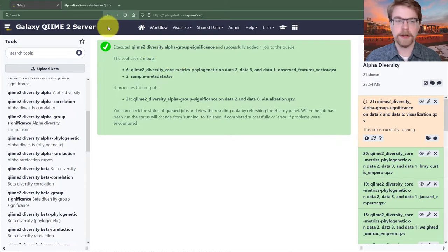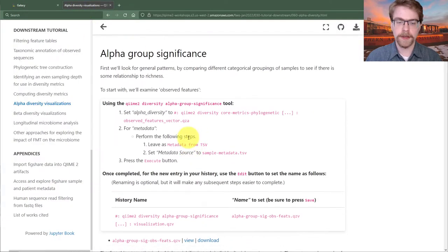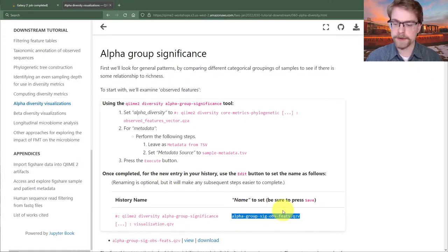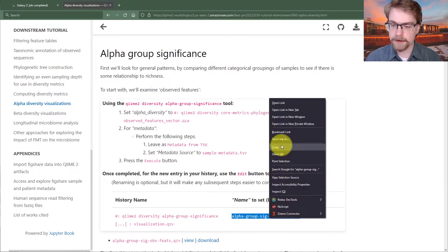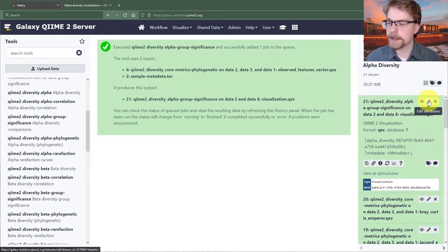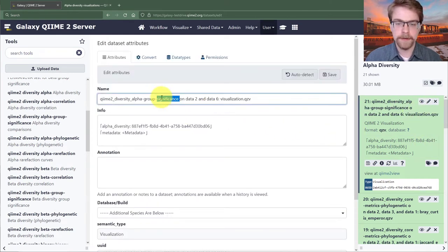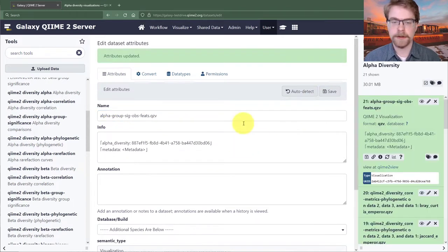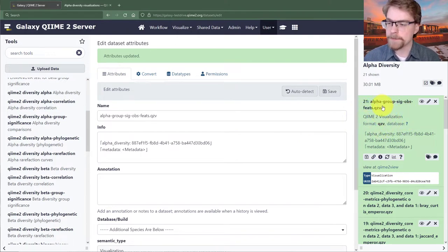We can see the report: two inputs produce this output. While that's generating, I'll go back to the instructions. We set our alpha diversity to observed features and our metadata to just our sample metadata. The tutorial recommends renaming this to 'alpha group sig observed features', so I'll copy that, press the edit button, and rename it.